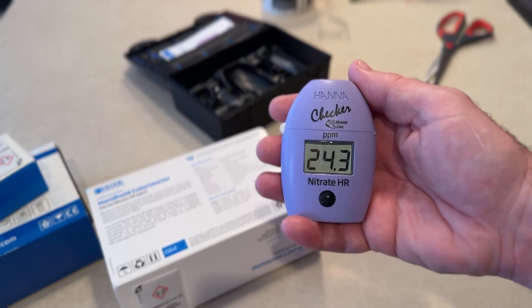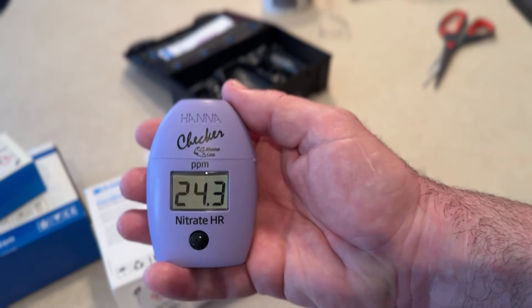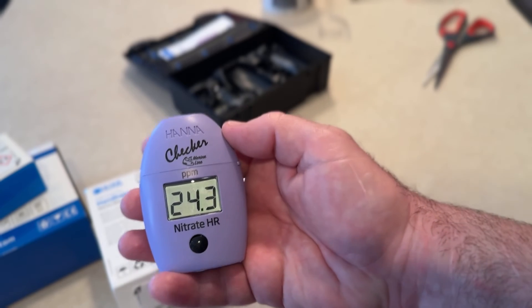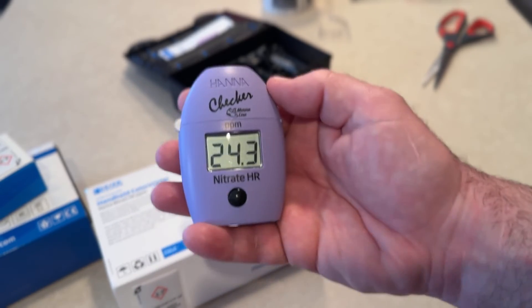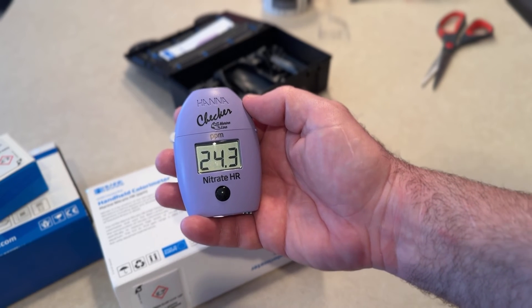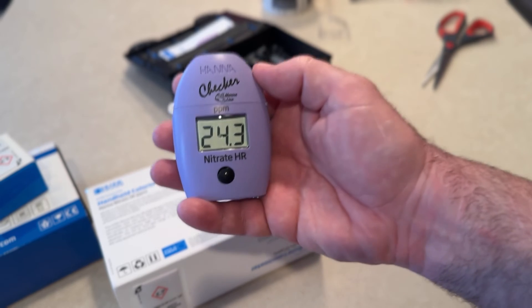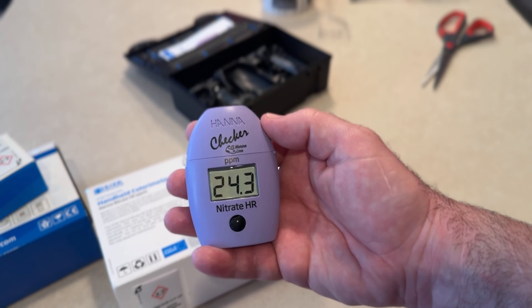24.3 parts per million. Hannah, if you're watching this — which I know you're not — it would be nice if you included a little card, so a new person to the aquarium hobby could see '24.3' and know what it means. I have no idea, so I guess you are expected to already know this, or you just look it up. But there it is. Next time we'll do the alkalinity one.